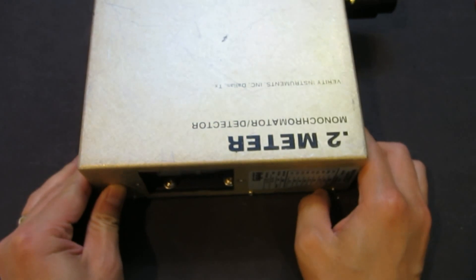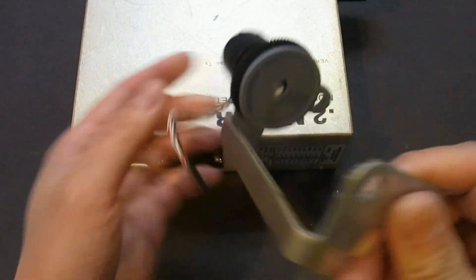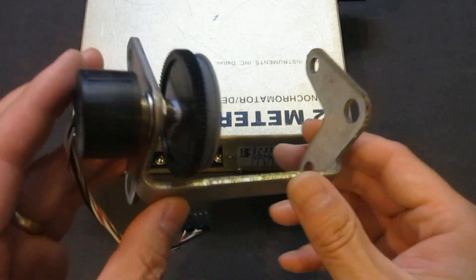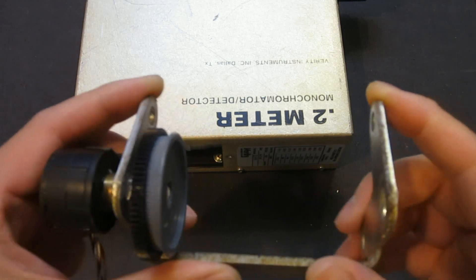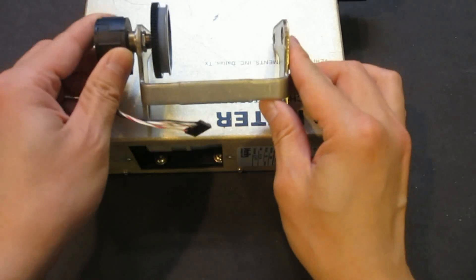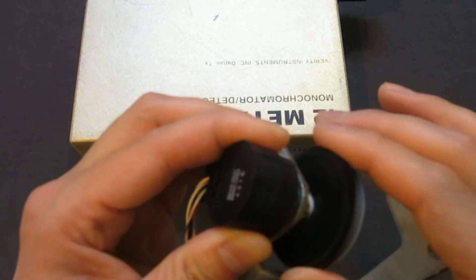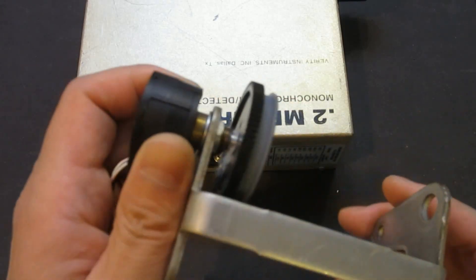So what I came up with is something like this — a very simple mechanism. I have this metal piece, I'm not sure where it came from, probably something I disassembled a while ago. I just like to keep all the parts — you never know when you're going to need one. So this serves as a frame, and what we have here is an optical encoder taken from an old HP piece of equipment that is no longer functioning.